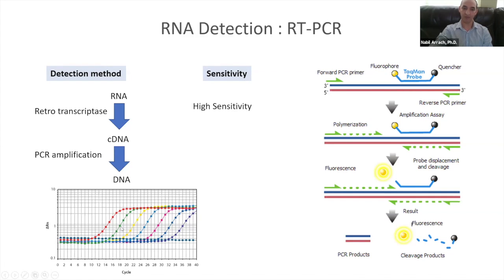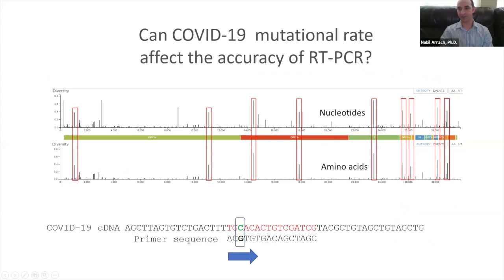If you have very little RNA, then you tend to detect the amplification later, which would be, in this case, the purple signal. On the y-axis is how much RNA, translated into cDNA and then DNA, you are detecting, and on the x-axis is when you are detecting that DNA. If you have any questions, please feel free to ask me either during the presentation or towards the end.